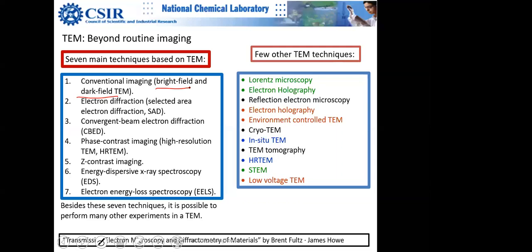And if you don't want to make an image out of the diffracted electrons, and you just look at the diffraction pattern like you do in X-rays, then you call it an electron diffraction pattern. We call it selected area electron diffraction because you can select the area. That beauty is that you can select the area. मुझे यहाँ से diffraction चाहिए, मुझे यहाँ से नहीं चाहिए, मुझे यहीं का crystallinity देखना है, मुझे इसी grain में interest है, इस grain का crystallinity मुझे अलग लग रहा है.